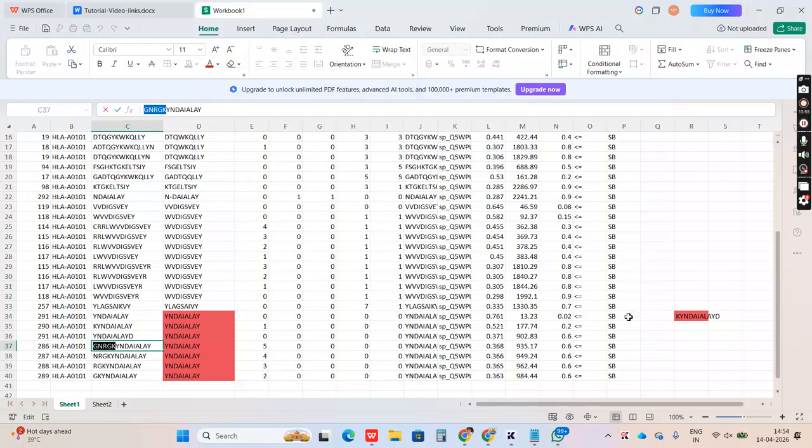Okay. So it means here you have to add all these things, GNRGK. Okay. And in the 38th row, you can see this is our core sequence, and the remaining is NRGK. It is already added, so no need to worry about it. Okay.